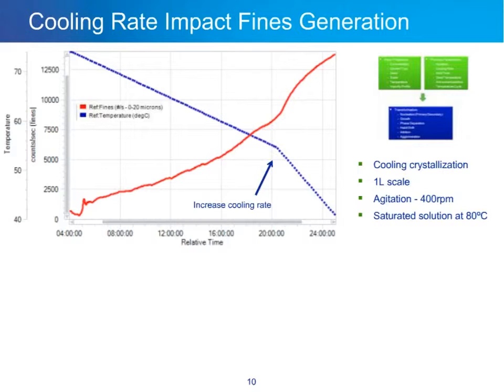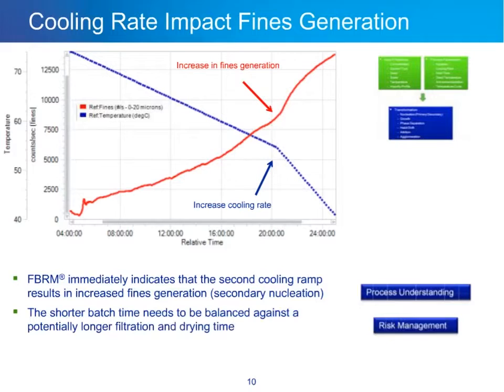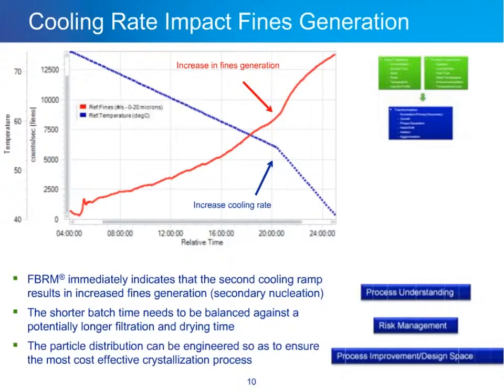An increase in the cooling rate results in increased fines generation. FBRM immediately indicates that the second cooling ramp results in increased fines generation — this is process understanding. The shorter batch time achieved by cooling faster for the final four hours needs to be balanced against a potentially longer filtration and drying time. The particle distribution can be engineered to ensure the most effective crystallization process by changing the cooling rate to generate the appropriate particle distribution for the best filtration and batch time.